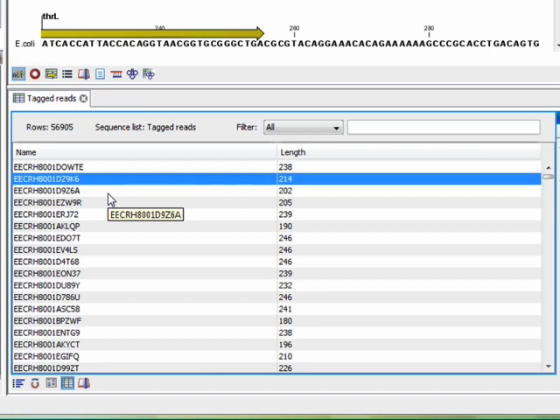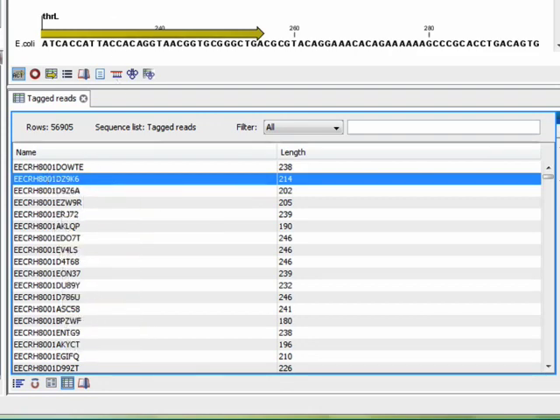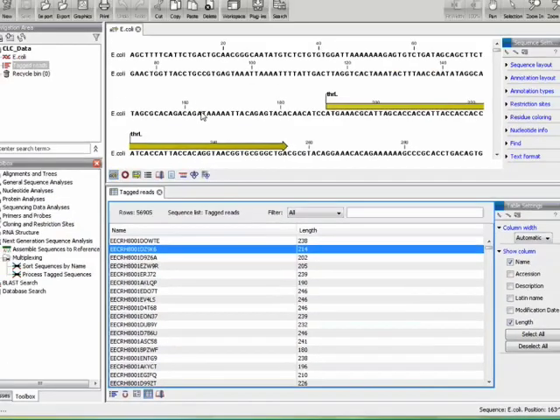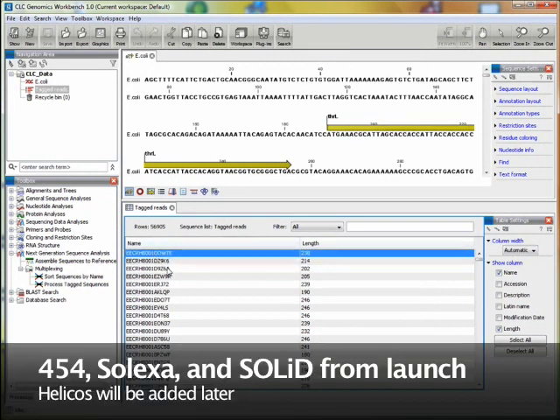I want to show you how to pre-process the data and then do a reference assembly of all these reads against the genome reference. The read data may come from the 454, Solexa, Solid, or Helicos sequencing systems.